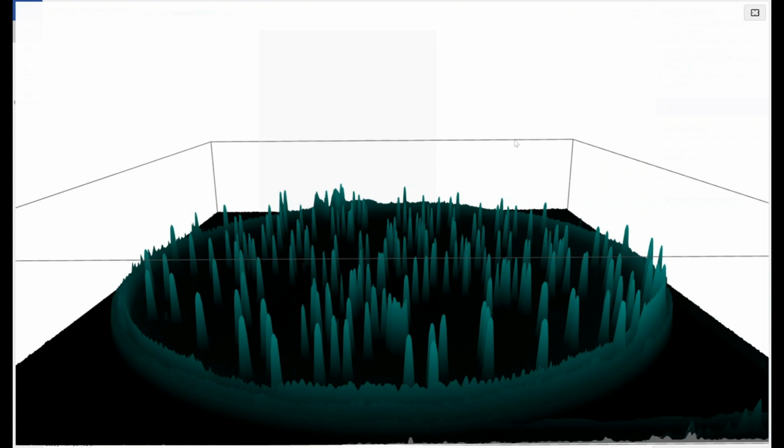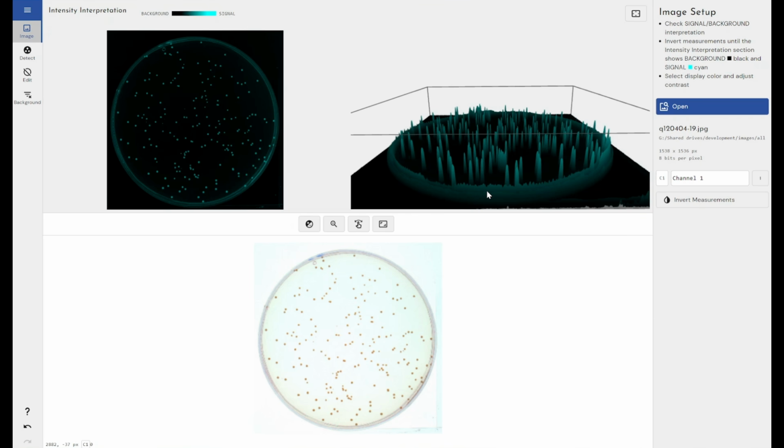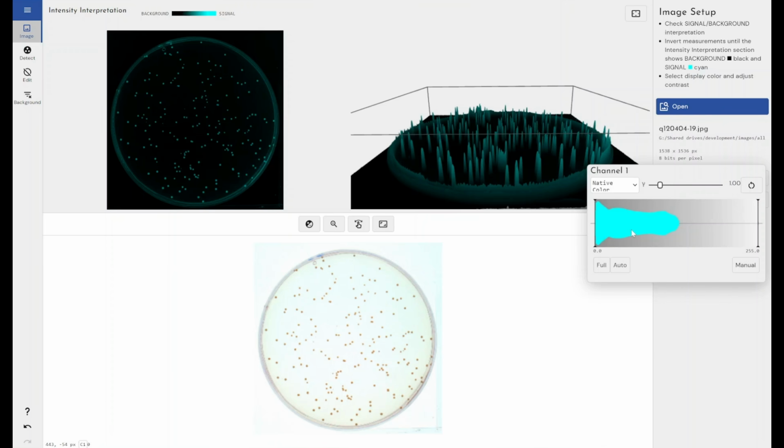When saved as a file, it can be imported into PowerPoint, Word, Canva, whatever you're using to produce your media. And at the bottom here, we can see the current image view. So this is the way the image has been brought in. And we've got all of the options available to us in terms of image adjustments that we have within the other Pharetics modules. So if I click here, I can change the contrast of the image and get it to display how I want it to.